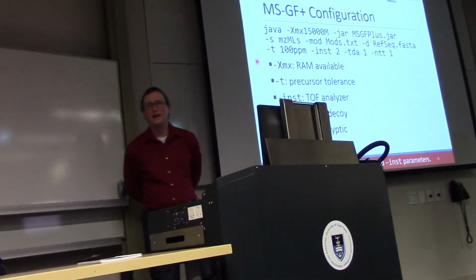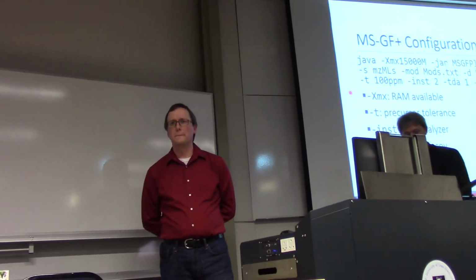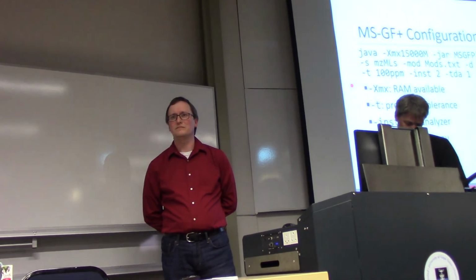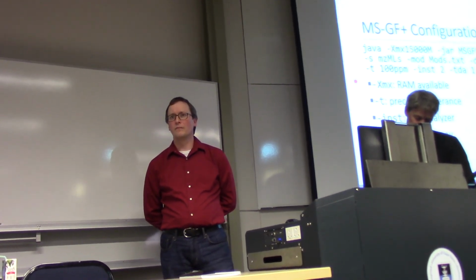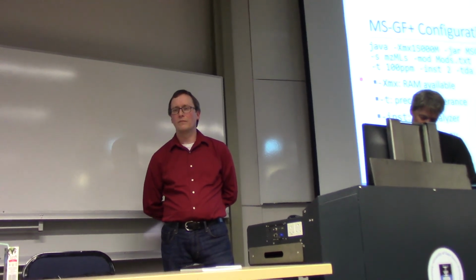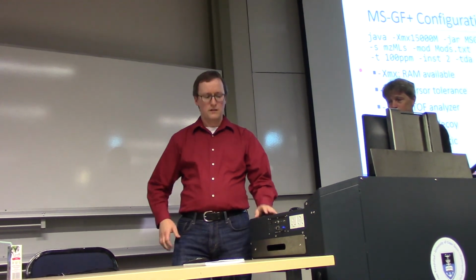Liam? It's not something that you specifically dealt with in your talk, but it came up in one of the other talks earlier, where Rudy Ebersol provided that peptide map, and there's that beautiful spray across your retention time m/z windows. My question there is, as you get to higher m/z's, there are fewer and fewer peptides that come through.